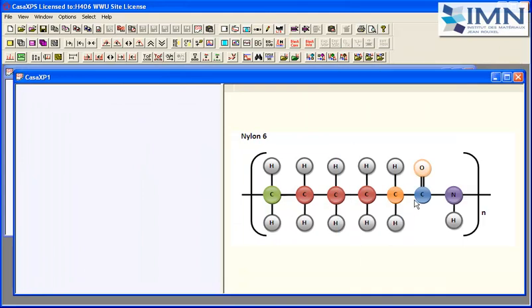We've got 3 of them which are bonded to hydrogen and bonded to carbon. We've got 1 that is bonded to nitrogen only, and we've got 1 that is bonded to oxygen, nitrogen, and then 1 that is bonded to the carbon that is also double bonded to oxygen.